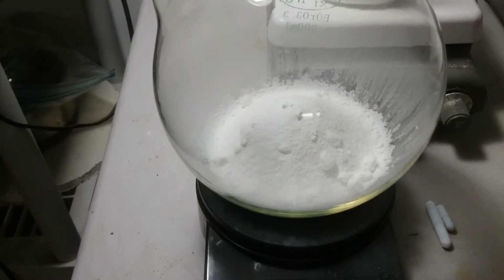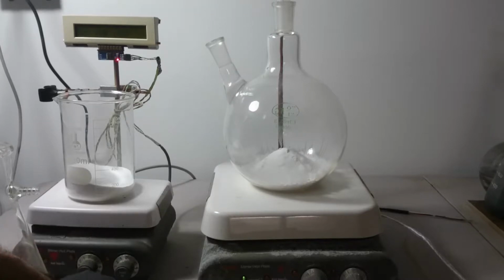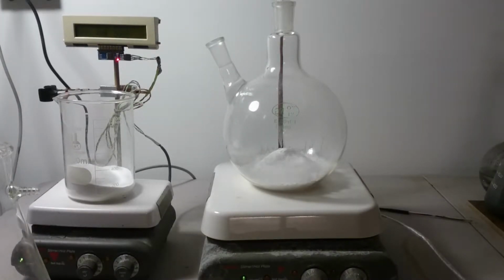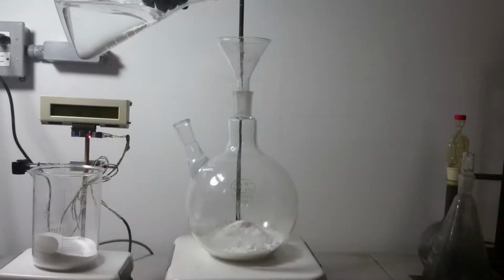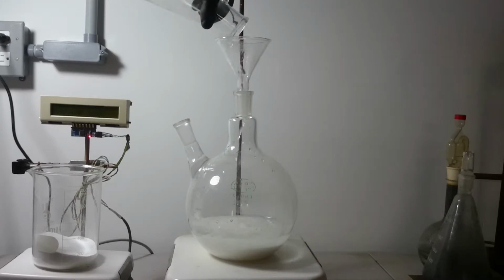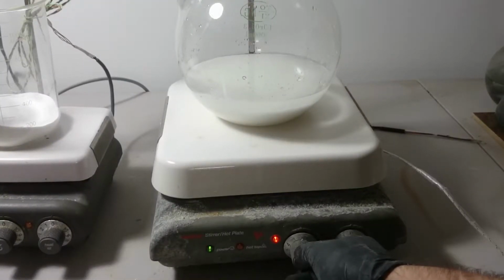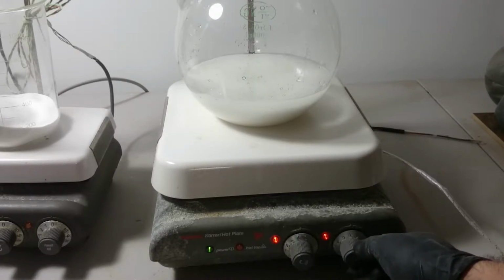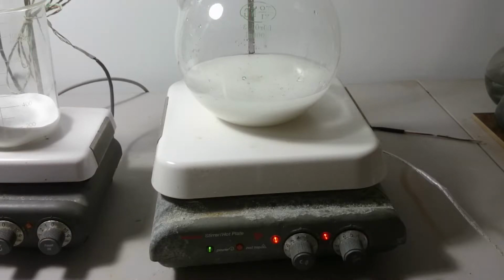Next I add 1 mole of sodium carbonate to a separate flask. Then a stir bar is added to each flask and an appropriate amount of water is added to dissolve everything. I usually use about a 5% excess to the theoretical amount of water because I've found that the theoretical calculated amount of water to dissolve things is never sufficient. Next, heating and stirring are turned on and I wait for everything to dissolve.